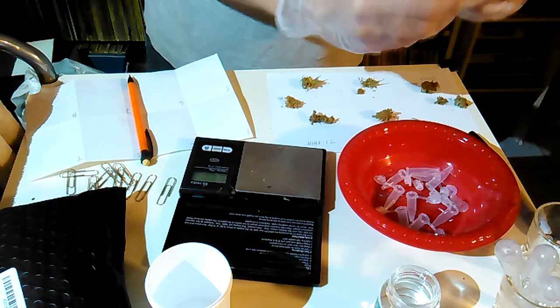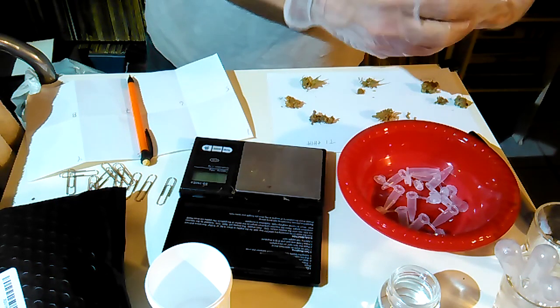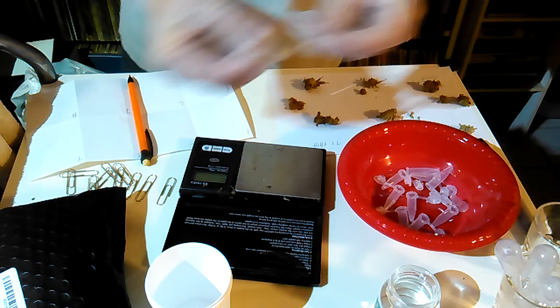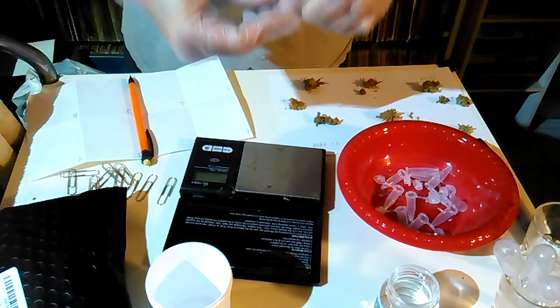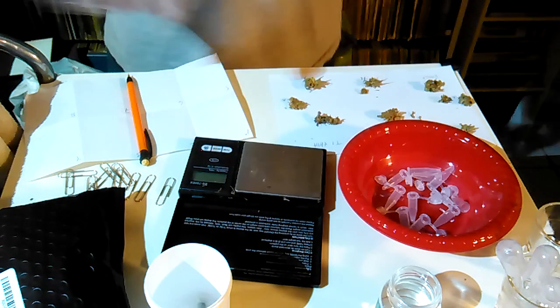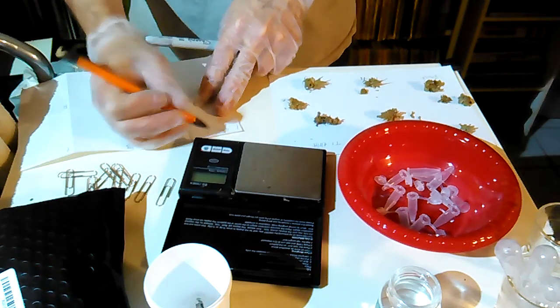But in general, I normally advocate being exact in measurements and everything. So you can see it's pretty much close to the bottom there. Cap it. Number one. And I'm going to write here GG next to 1.